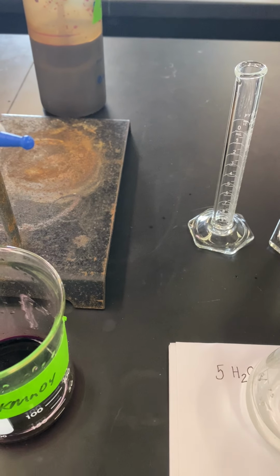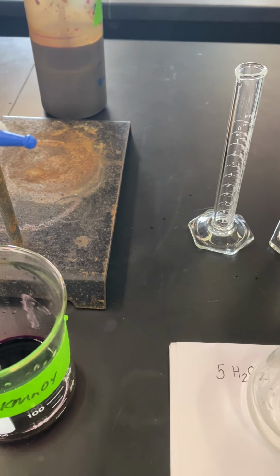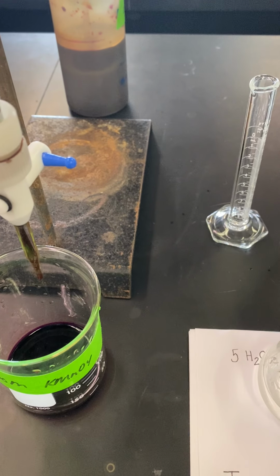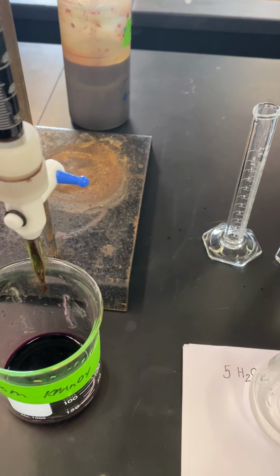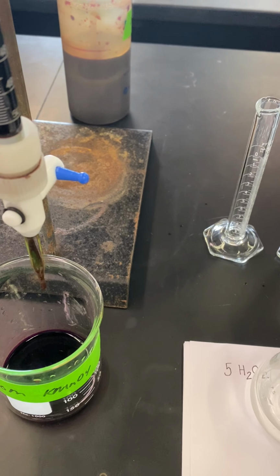And we're adding 15 milliliters of the sulfuric acid. It's in a large excess, so again, it does not have to be exactly 15 milliliters. If you're a little over, that is A-okay as well.